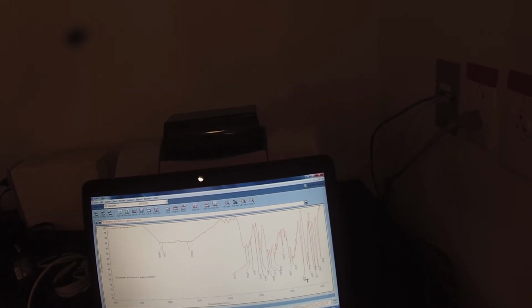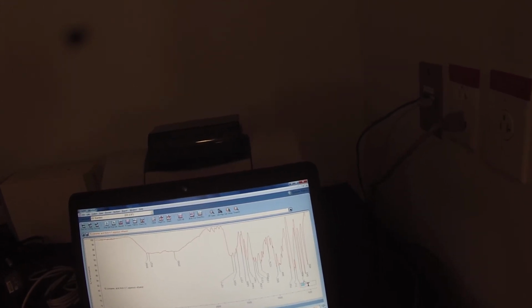It wasn't the best pellet either. Some of these peaks in here are the monosubstituted benzene region. Monosubstituted benzene usually has two peaks in that kind of 700-ish region, so the 711 and the 769 might be that monosubstituted benzene. Oops, didn't mean to delete that one. That's a sharp peak, and I missed. Gotta hold the shift key down so that it gets the center of the peak. So that's nice looking. We'll save that and print it.